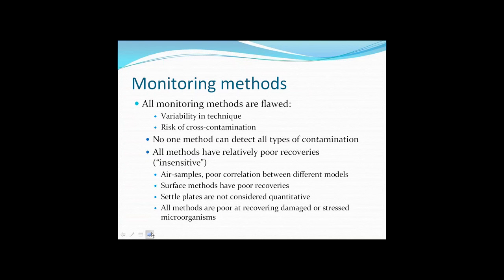in fact the very types of organisms that we would expect to find surviving within the harsh environment of the aseptic filling area. So for example, with active air samplers, there are various different types of models on the market, such as those that work by impaction or centrifugal force or filtration. So there is variation between the models. Some published studies indicate that they can vary in their efficiency by up to 10-fold, and they have issues of accuracy, precision and sensitivity.